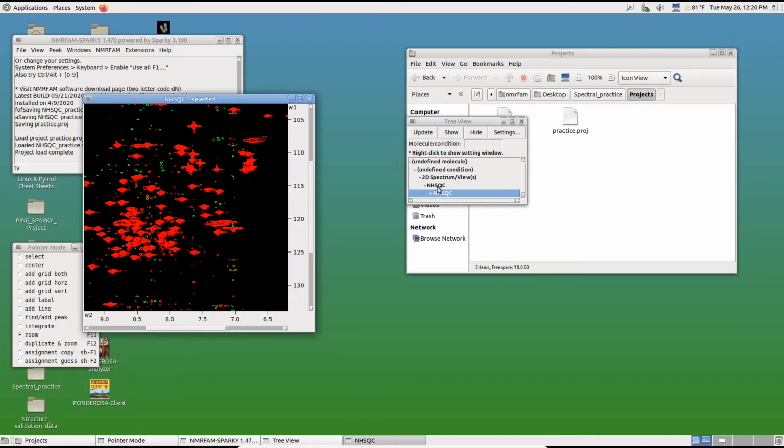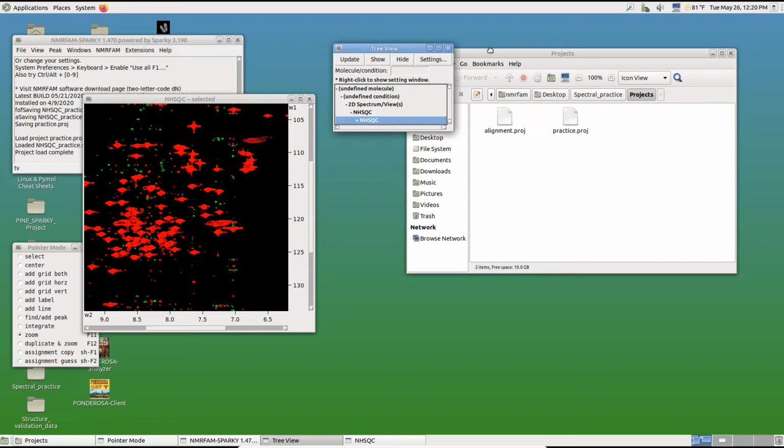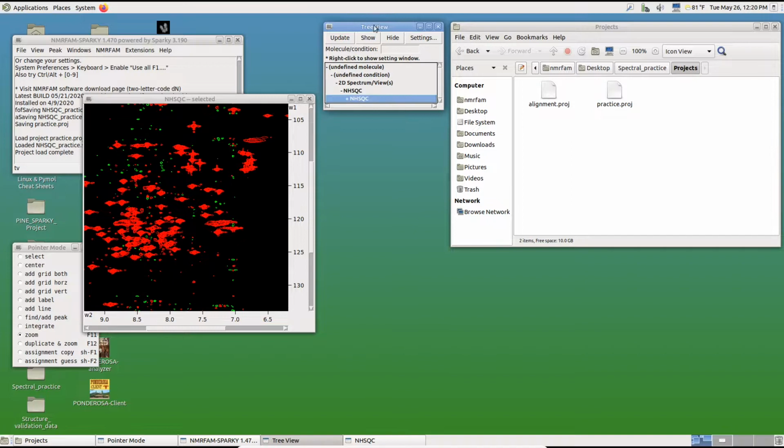It's gonna be a lot easier, but if you just click this X, then it's gonna be completely gone, so you can just open the save file again. But it's gonna be a little more work in case you have set some more features such as referencing and synchronizations and so on. So it's a little more work you need to do to set it up, so you don't want to do that.